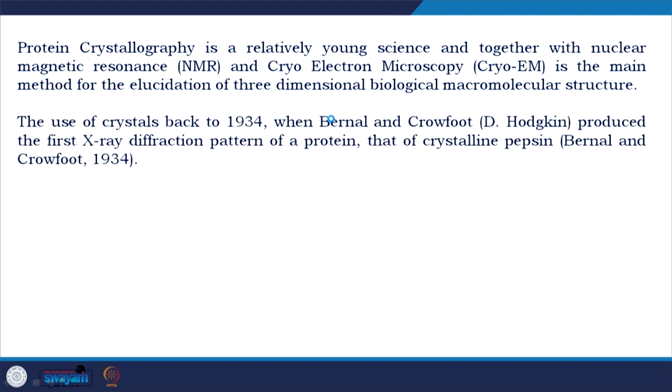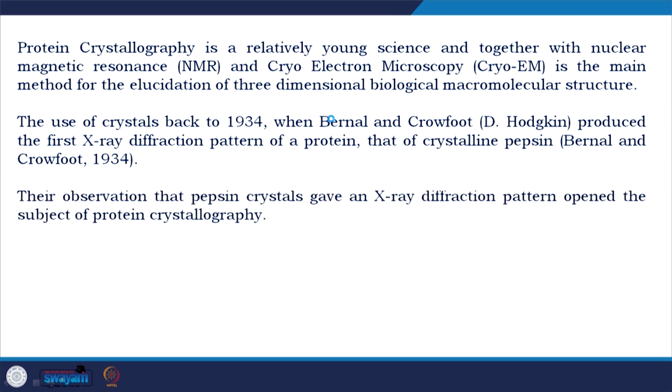The use of crystals goes back to 1934, when Bernal and Crowfoot, Dorothy Hodgkin, produced the first X-ray diffraction pattern of a protein, that of a crystalline pepsin. Their observation that pepsin crystal gave an X-ray diffraction pattern opened the subject of protein crystallography.